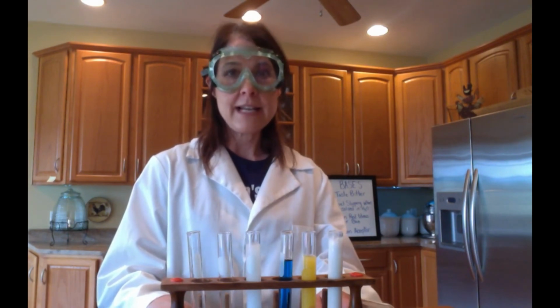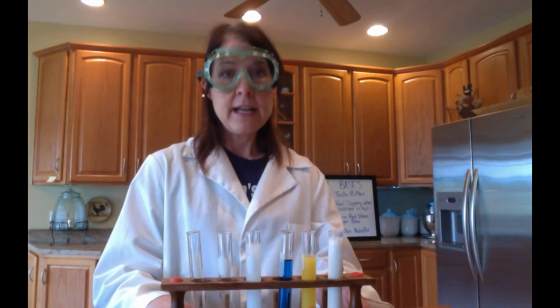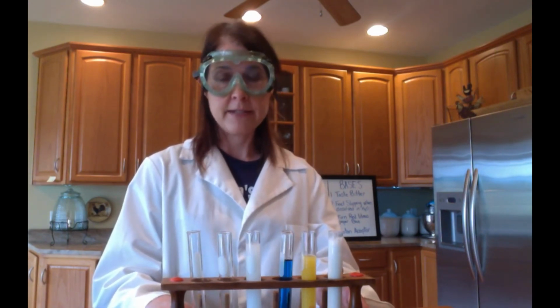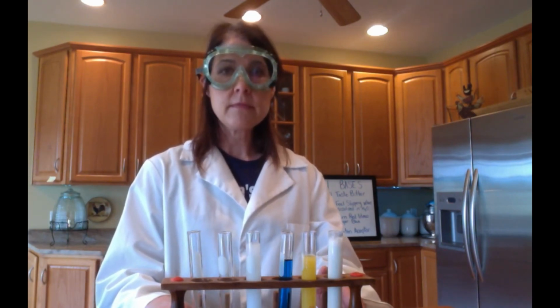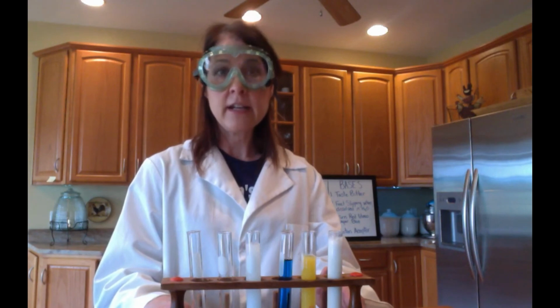So we have tested a variety of common household substances to help us remember the characteristics of an acid and a base. Let's review those. Remember that an acid will taste sour. An acid is a covalent compound that when in water can conduct electricity.